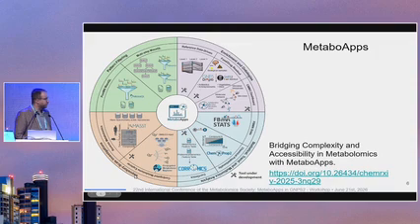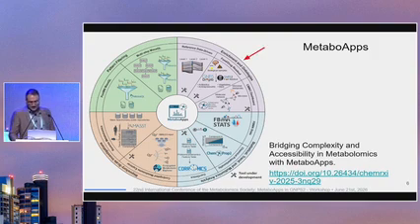And then we also have the conjugated metabolome explorer, which is also under development, which is a repository for information of new conjugates that are derived from mass spectral data. And also, some of you might ask if they are host-based, microbial-based, or monoculture. We're going to discuss a little bit more on that. And for the specifics, I ask you to check the paper, because there is a lot of information for all those tools.